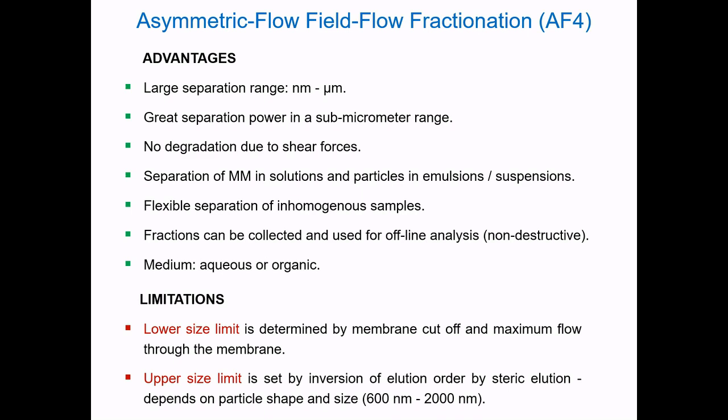AF4 is distinguished by a large separation range, from few nanometers to about a micrometer in size. AF4 has great separation power, especially in a submicrometer range. There is no degradation due to shear forces.